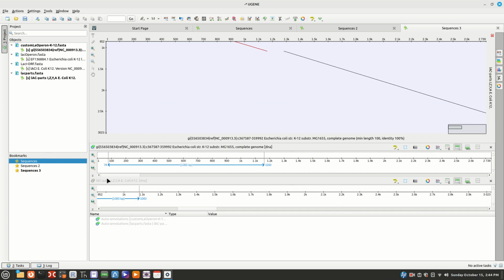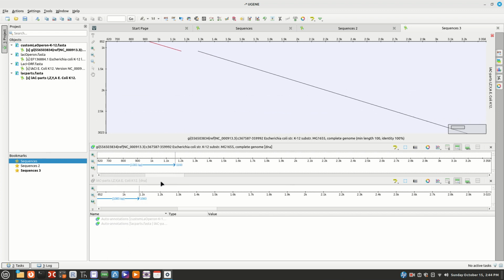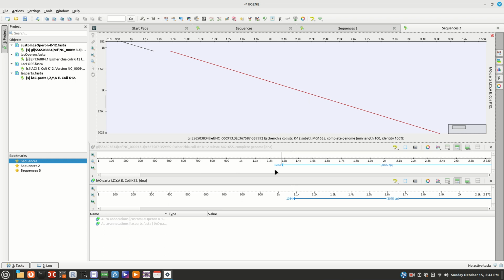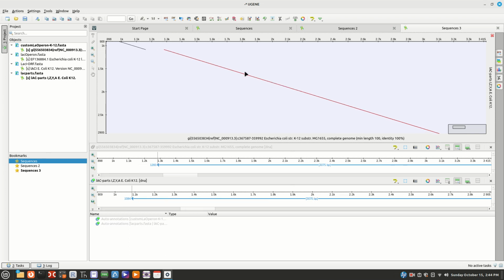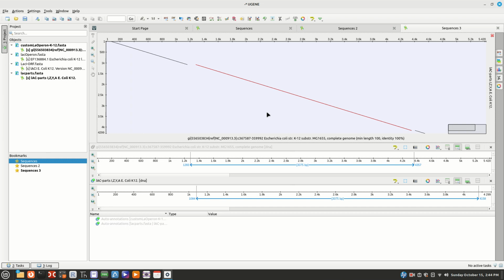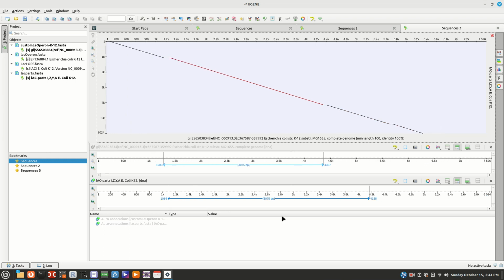So here is our beginning part, and we're going to scroll toward this area, and that is at 1160, and then we're going to grab this, and that is 1283. So the difference between 1160 and there would let you find your numbers in between these two regions. That's just one way you could look at it graphically here. That's not the way I would prefer, but you can go grab these pieces in between here.